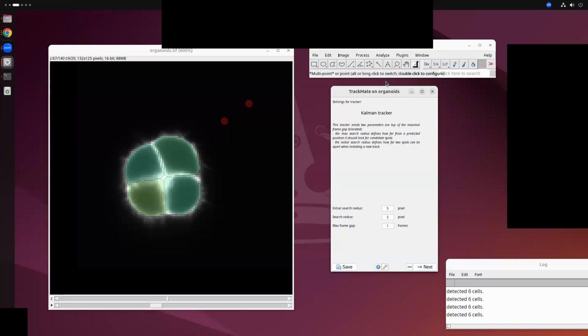That's usually where deep learning models struggle. Our model is trained on a very, very large set of data, probably larger than anything published so far, so we are very happy with its generalizability. But if it doesn't work very well on your images, I would encourage you to send me your images, and we are continuously tweaking our model and trying to make it more generalizable.